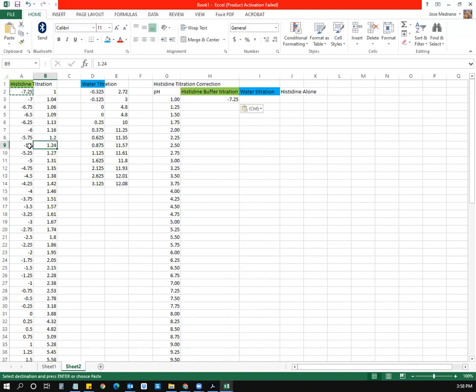In terms of proximity, anything within 0.05 in either direction in pH units, you're more than welcome to just copy those titrant values without having to use the graph to estimate. So I just keep on doing this over and over again. I'm looking for 1.5. I got like 1.51 here. I like that. I'll go ahead and copy that. 1.75. I got a 1.74 right here. I'll copy that and paste it over.